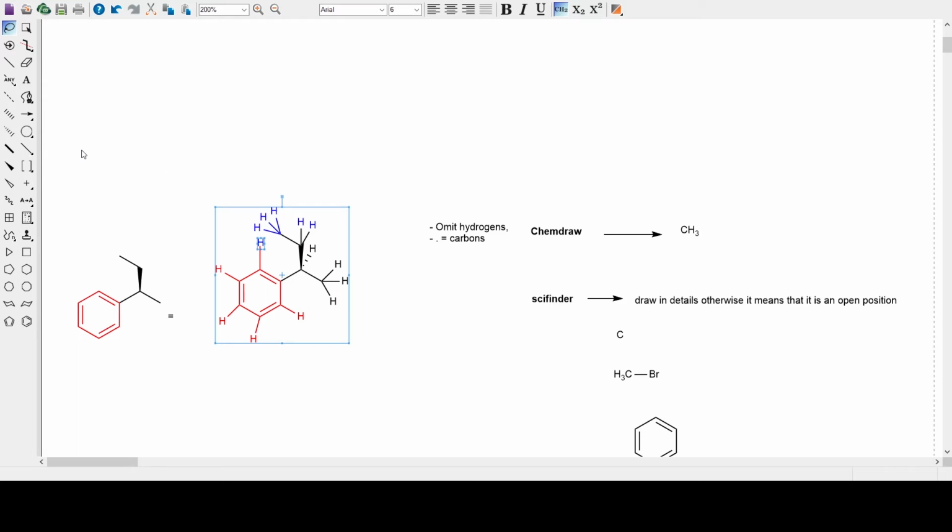You have the isotope and the mass is here. 100% and 1 small percent of isotopes, les isotopes, ok? Ça, c'est la masse exacte, en fait, avec tout le profil. This is the profile by mass. I just remind you that we check everything depending on the mass and the NMR, most of the time. NMR, analysis. On analyse les produits chimiques. Mainly, ok, il n'y a pas que ça. Analysis.